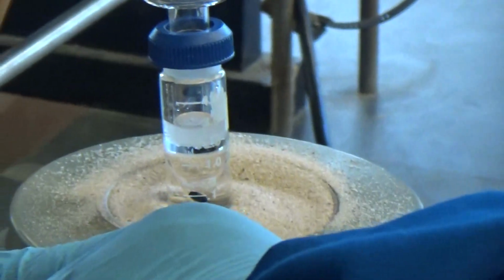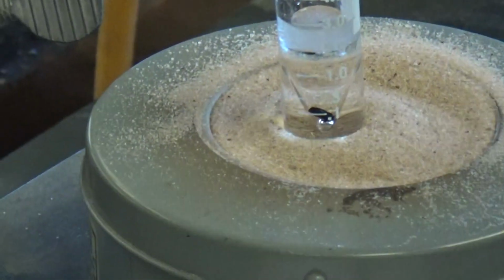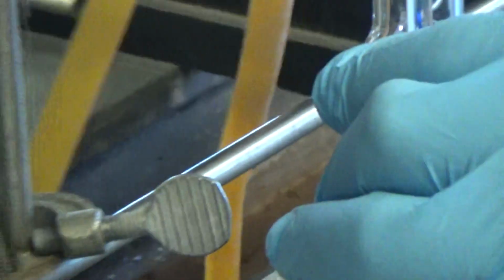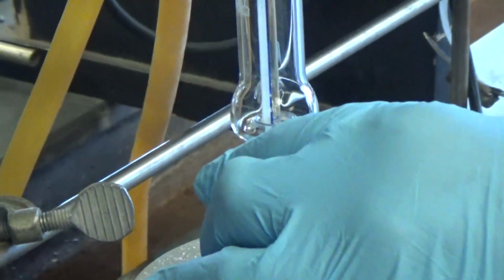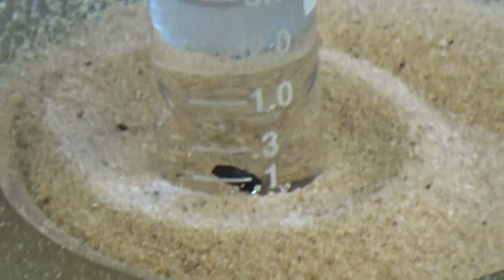Now that has to go to 100 degrees Celsius. Sometimes I make a little mountain of sand around it. Yeah, I need to put that correctly. This one has to be here like that. Drop the thermometer in there. That's how it's supposed to be. So the thermometer is kind of deep in there, and it gets that lower temperature. So now we just wait.